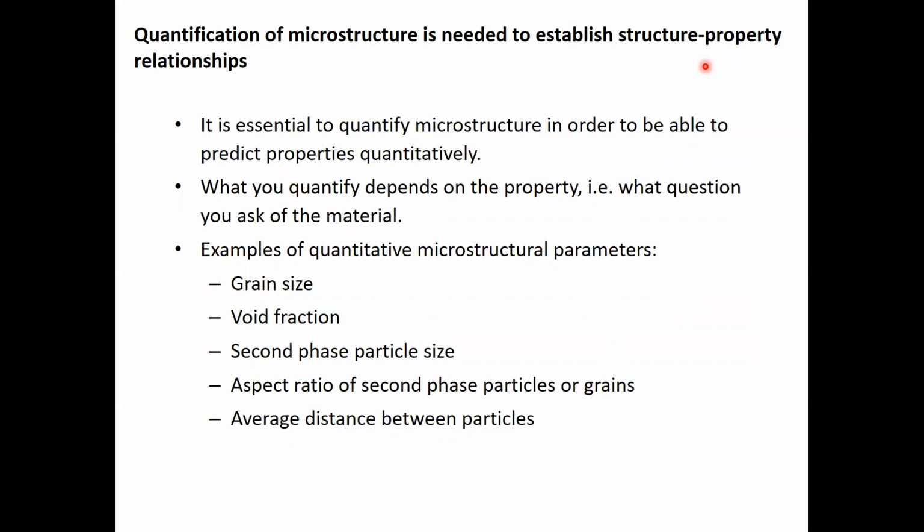By doing rolling, you can change the dimensions in certain directions, and then you can end up changing the mechanical properties of them. So the first step is to figure out how we want to look at these microstructural images of grain boundaries and how we go about quantifying them, right? So that's what we're going to take a look at in this lecture and for your assignment.